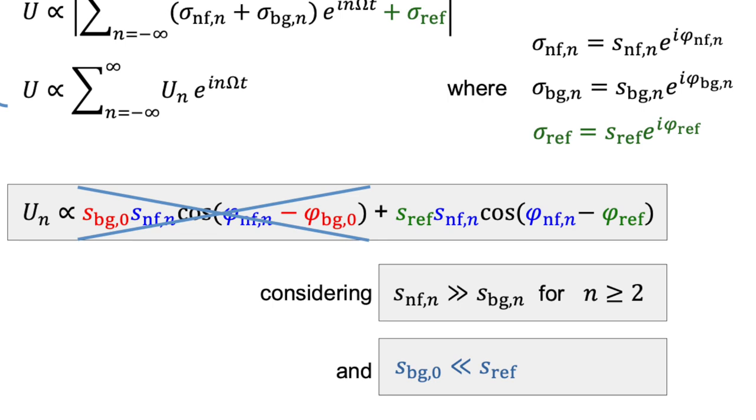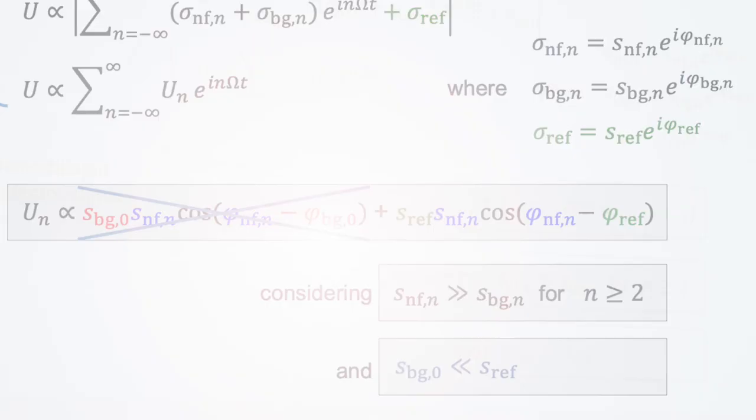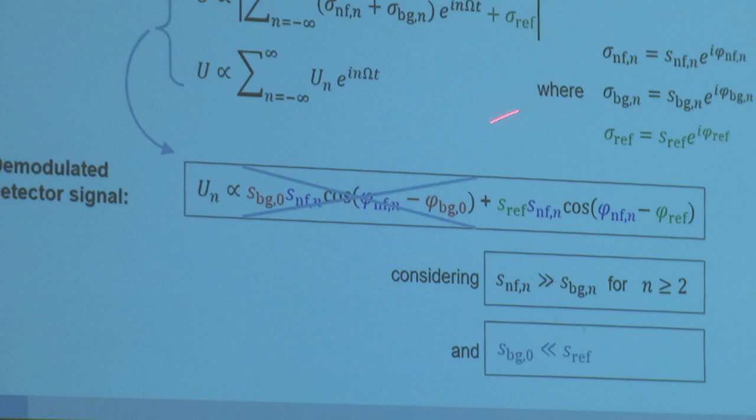And in some cases it works, but in a real experiment with an s-SNOM, it often does not work, because you would blow up the detector or get it into saturation. So this is a little bit of a tricky issue. You cannot necessarily do that. We can do that with pseudo-heterodyne detection, and Martin will show you how, but I leave it for him. So now, for the moment, let's assume we eliminate this term too, then we have this one left.